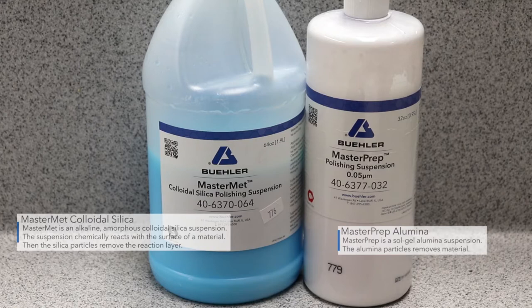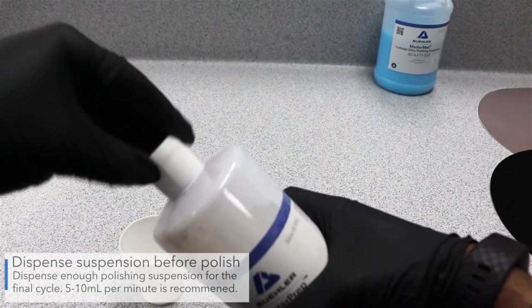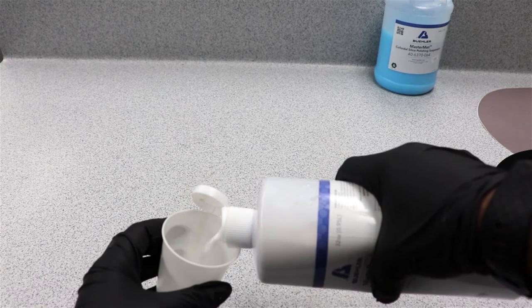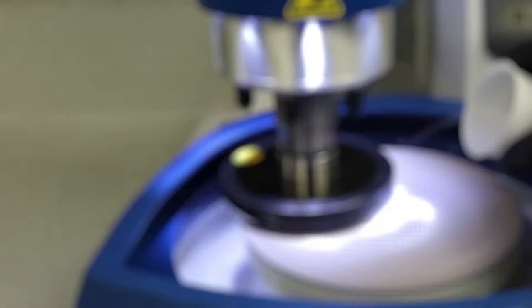Before final polish, dispense enough final polishing suspension for the polishing cycle. Typically, 5 to 10 milliliters per minute is recommended. Remember to wet the cloth with water before the cycle begins. This helps the polishing suspension spread.